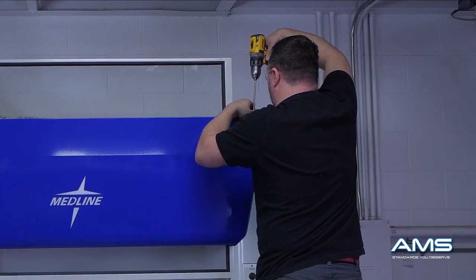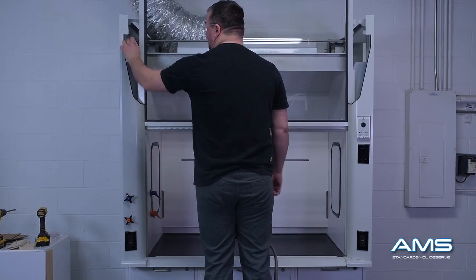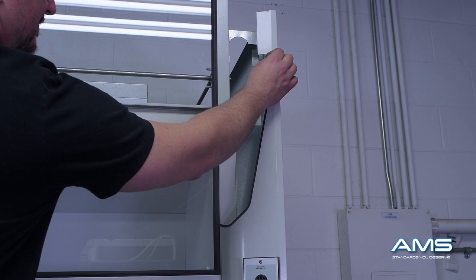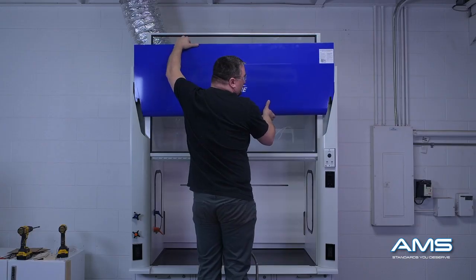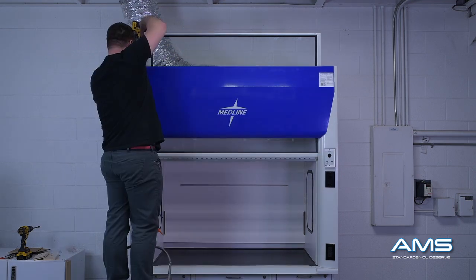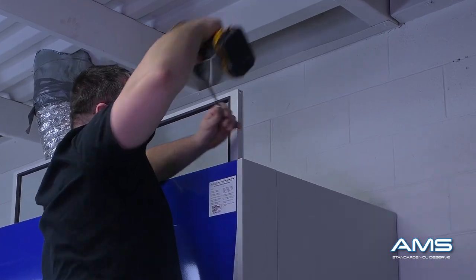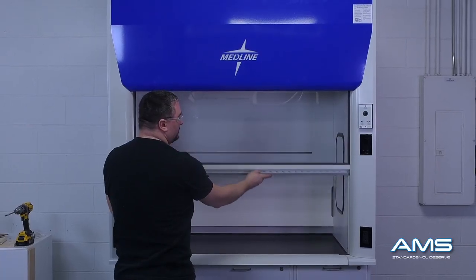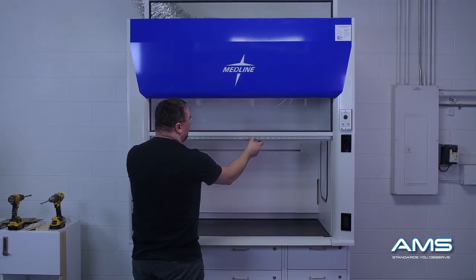Now that the fume hood is set into position, remove the front panel so that the transport protective guards can be removed. These are there to prevent the panels from scratching the fume hood posts during transport. Place the front panel back on the hood and screw it down one last time. After securing the front panel, check the hood's functionality one more time — everything should function and flow smoothly. You are now ready for MEP.